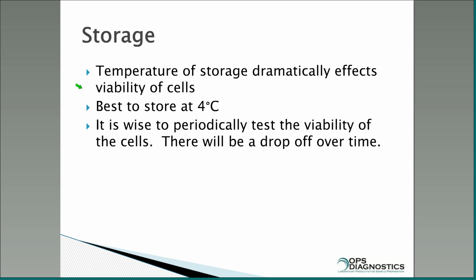I'll show you some data in a second, but where a cell stored at 4 degrees could last for years, something stored at 37 may last only a few days. And I think it's because there's so many different components in a biological system that can go bad, as opposed to, let's say, a solution where there's one protein or something, that the drop in viability is extremely pronounced. But however you store these things, it's important to test them.